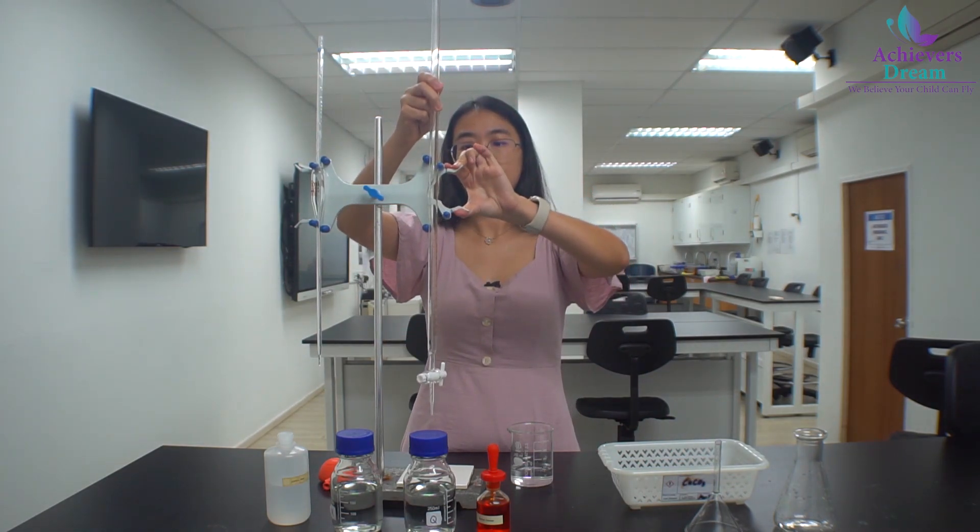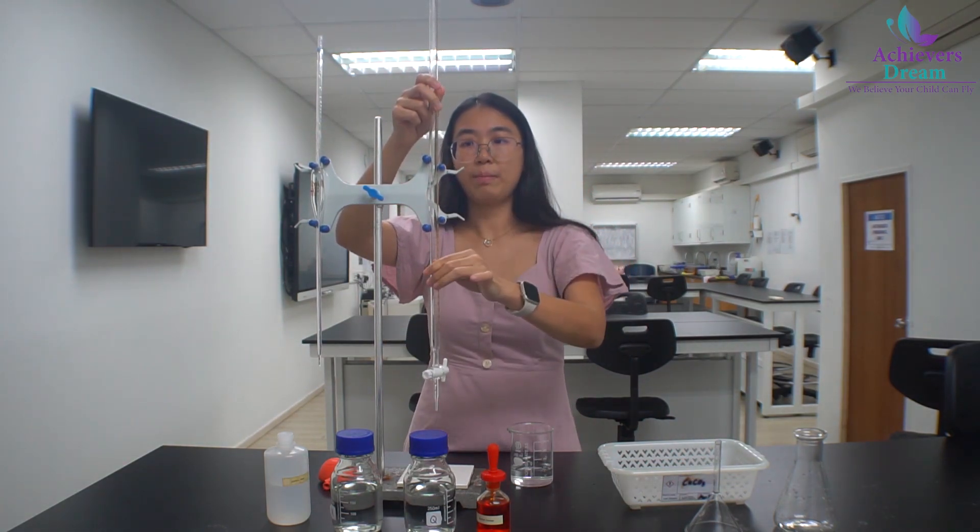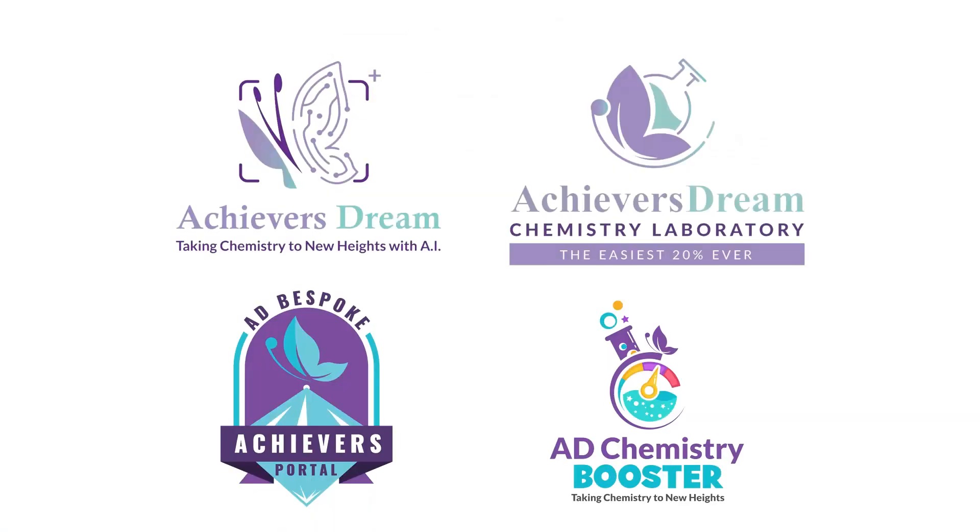Once this is done, place the burette back onto the stand and both the pipette and burette are ready to use for titration. Bye!